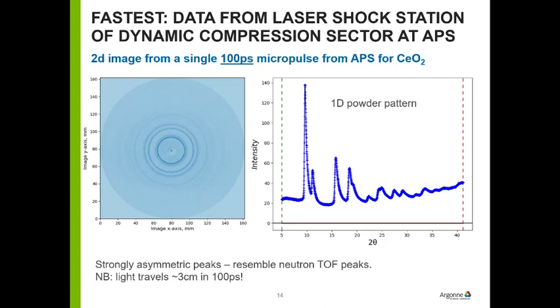And so the simultaneous experiment is to try to probe what's going on in this material under extremes of temperature and pressure. Sort of a shock experiment. Not too different from the kind of thing I did with PETN, but I didn't want to blow it up. So they created a powder pattern of the test material, which is cerium dioxide, which looks like the thing over there, in a single bunch, single pulse of X-rays from APS. And they said, can you analyze this?